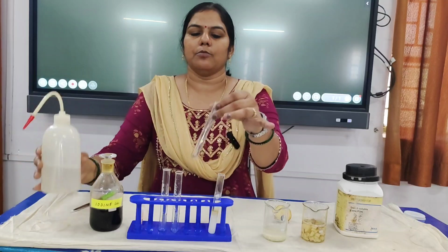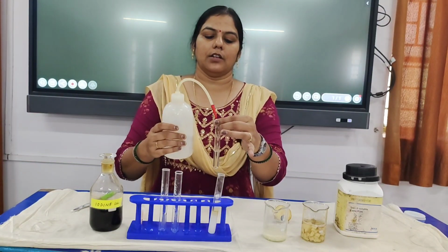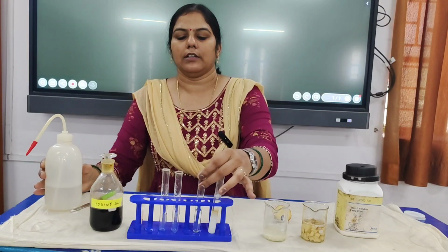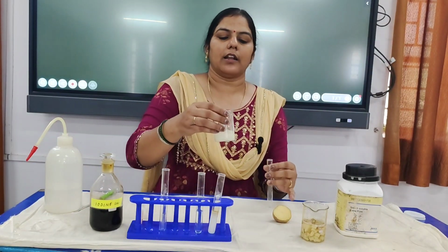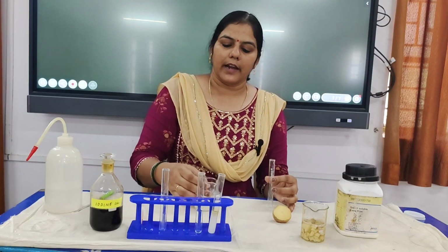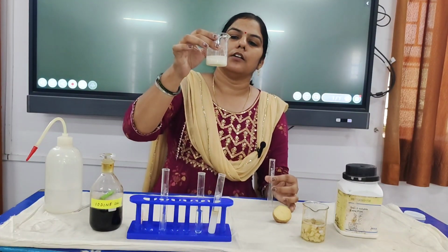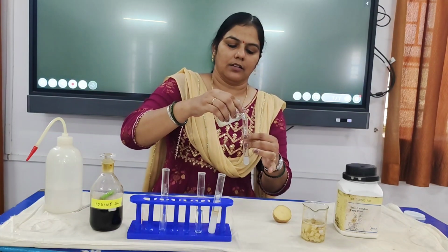In the second test tube, I am adding plain water. This will serve as a negative control. Then in the third tube, I am adding rice water. This is just rice soaked in water, and I will take the water in which the starch from the rice has come out.